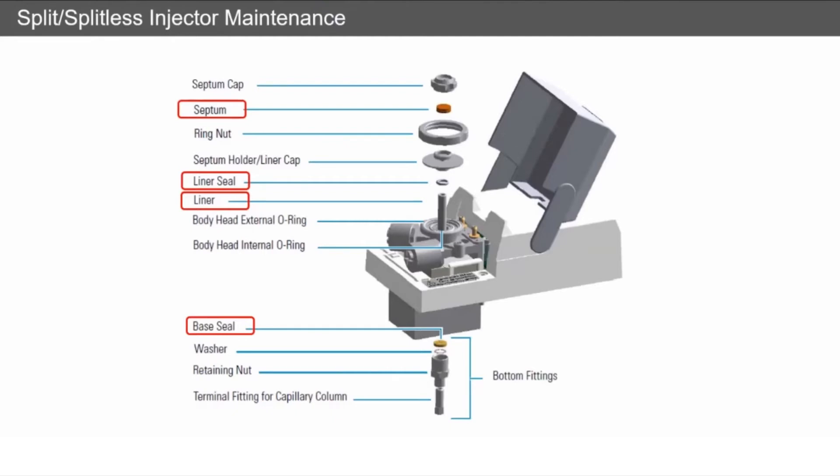Something that's regularly overlooked changing is the liner seal, which is a little o-ring. So replace this whenever you change the liner. They become compressed, they become brittle, and you start getting leaks and irreproducible split flows.